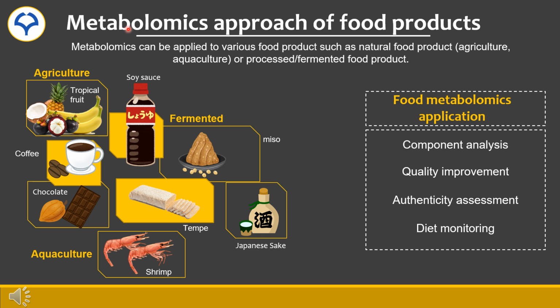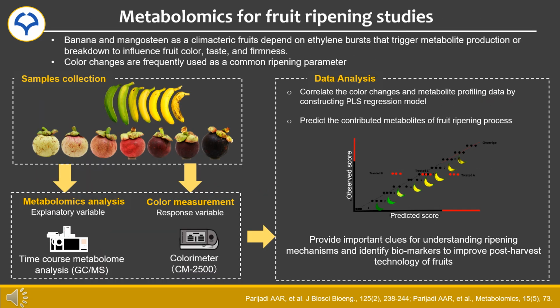Metabolomics is applied to a wide range of foods, including agricultural products and fermented foods. In the Fukusaki laboratory, we conduct research on various foods, including fruits, coffee, chocolate, and tempeh, a fermented food from Indonesia. Through component analysis, we aim to manage and improve the quality of food and identify its origin. Now, I would like to introduce some of the actual research being conducted.